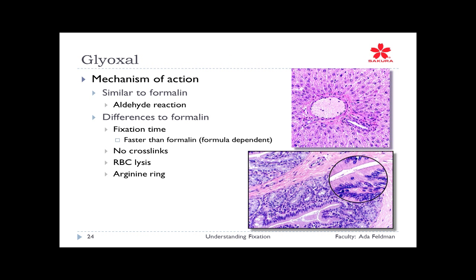Okay, so let's take a look to see how this glyoxal really looks. All right, these two photographs here are glyoxal fixation. Okay, they are providing the optimal look. All right, totally similar to formalin, and it's because it's attaching the same way. It's aldehyde fixation.